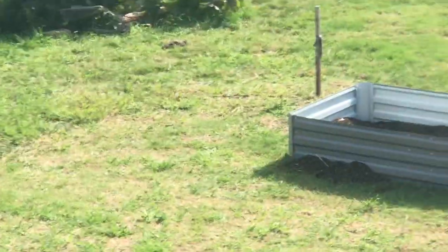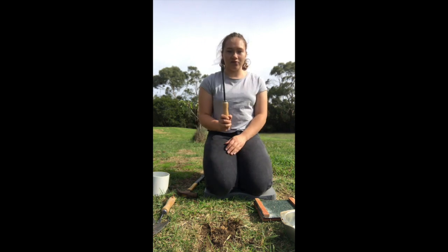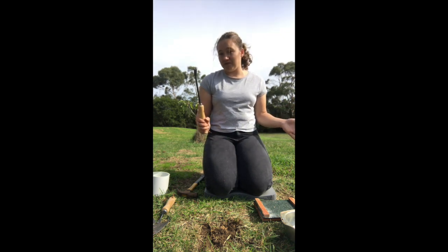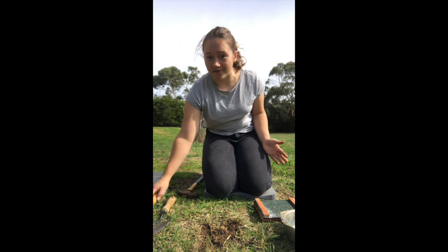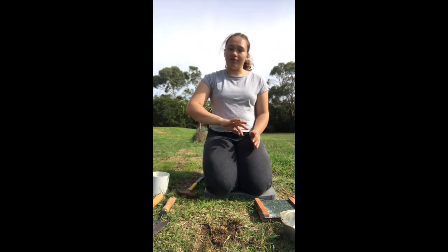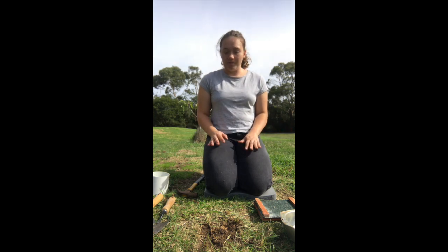Next, we're going to choose a location to do our soil sample. Let's do it down here, near the garden beds. Now we will begin the process of collecting our soil sample. As you can see here, I've used a tool to quickly scrape away some of the grass from the small amount of O-horizon that I actually do have in my soil. If you have a large O-horizon or organic layer, it's ideal to scrape it away before we collect our sample.